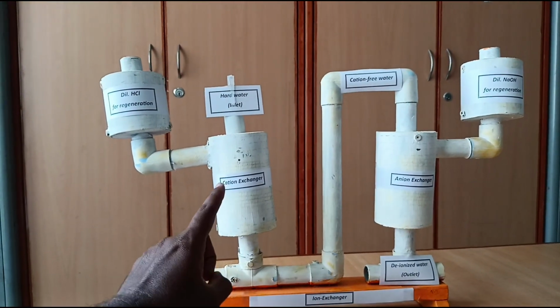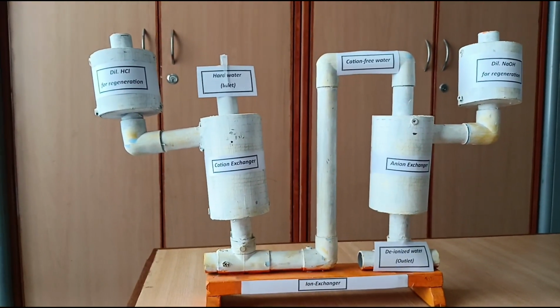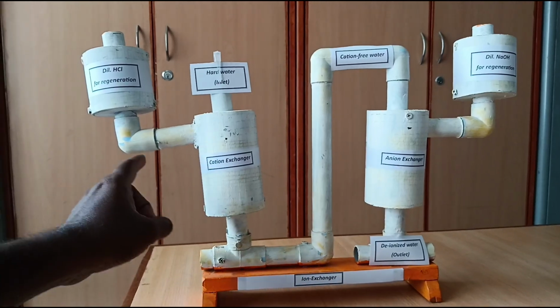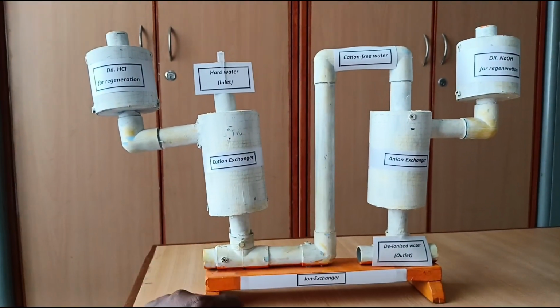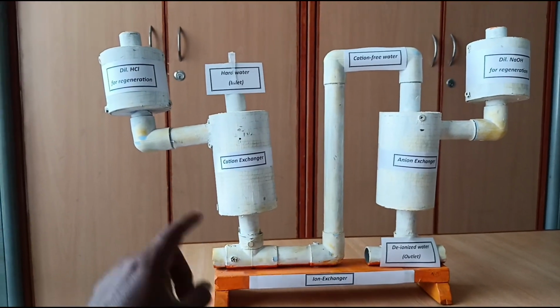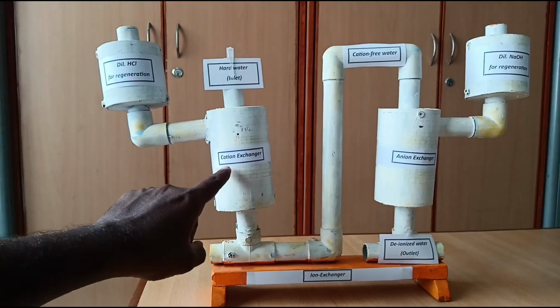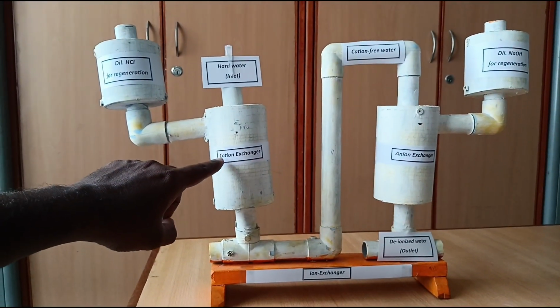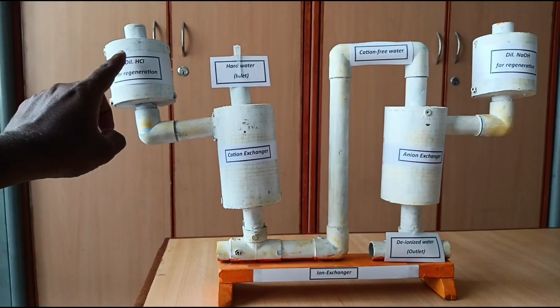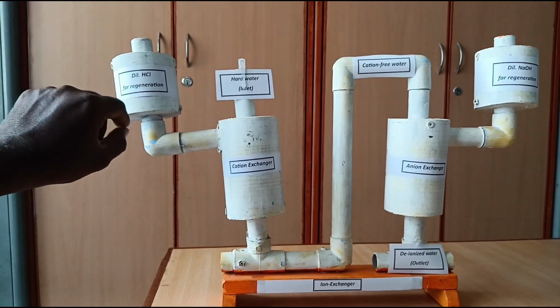And if we want to regenerate this cation exchanger and anion exchanger, we can do this by adding some solution. If we want to regenerate the cation exchanger, we need to add dilute HCl. When we pass this dilute HCl through this cation exchanger column, all the cations which were absorbed earlier are replaced by H+ ions which are present in this dilute HCl solution.